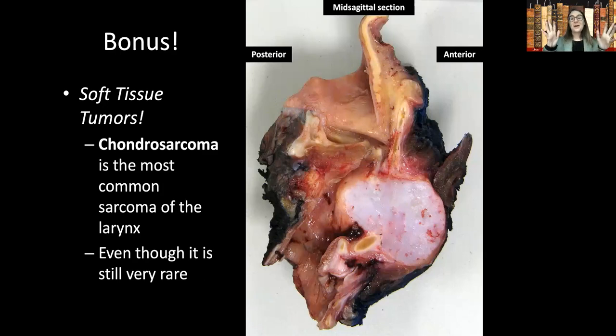Bonus. So we didn't talk about this earlier, but I thought I'd throw in a bonus specimen, which is going to be soft tissue tumors. So what soft tissue tumors are you going to expect to see in the larynx? Like not many at all.